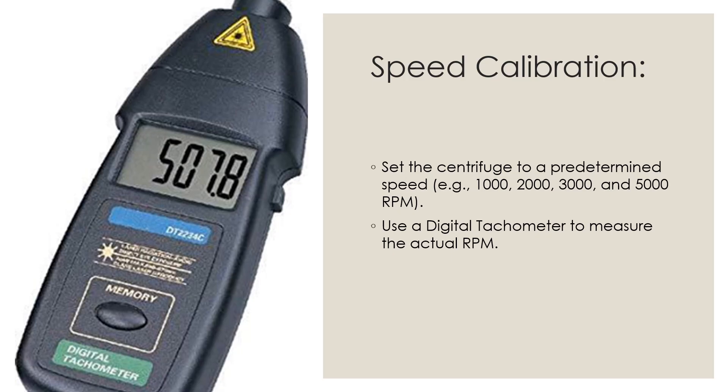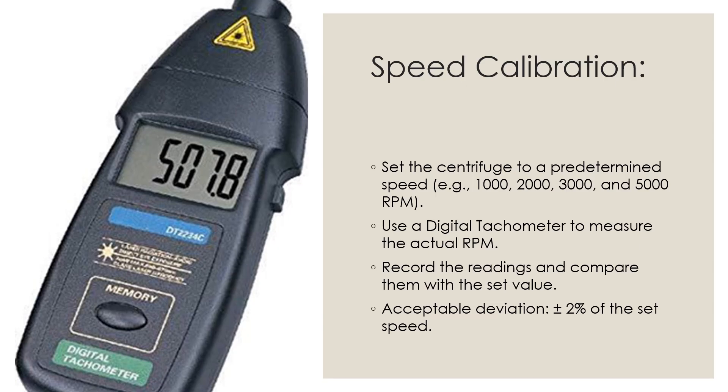Use a digital tachometer to measure the actual RPM. Once you set the RPM and start the centrifuge, use the tachometer to determine the actual RPM. Then record the reading and compare it with the set value. The acceptance criteria should be plus or minus 2% of the set speed.